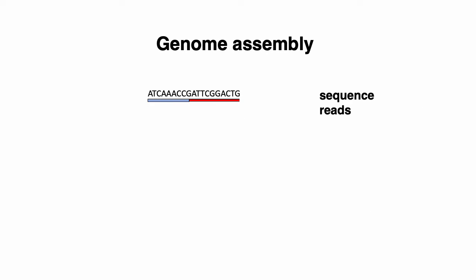Genome assembly is the topic of the next lecture, but just to summarize it in a nutshell, the idea is that you start out with some kind of genome sequence, which you're assuming is very long. Then you go through your library prep process where you fragment the genome and sequence a bunch of reads.